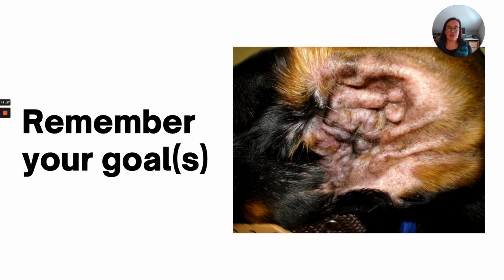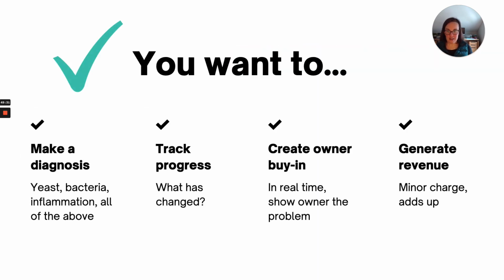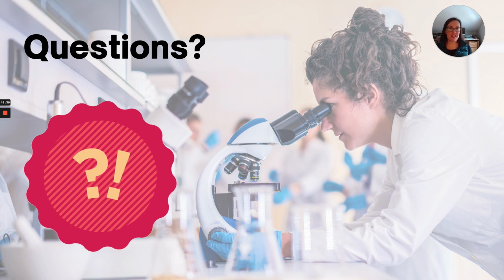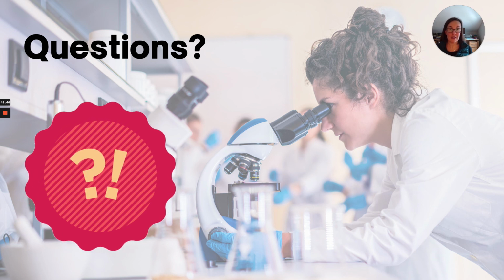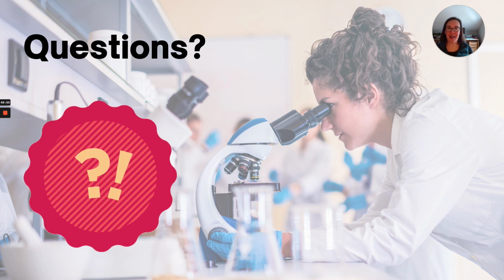And again, when you're doing cytology, you really want to remember your goals. You're attempting to make a diagnosis, you want to track progress, you want the owner to be right there with you, and you're hoping to generate a little bit of revenue. These are pretty low-hanging fruit goals that we have, but I do think cytology is very useful for all of us in the clinic.